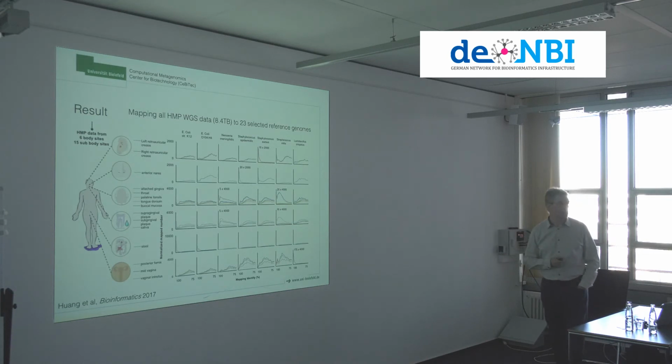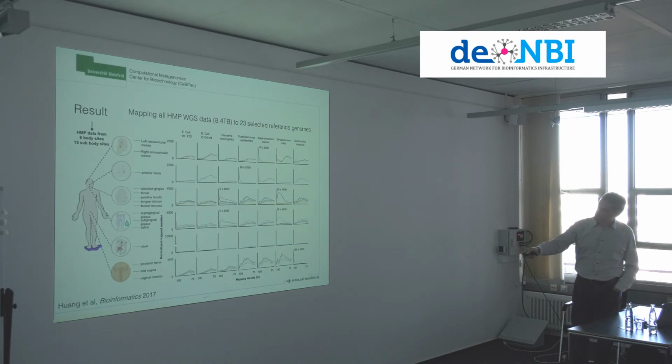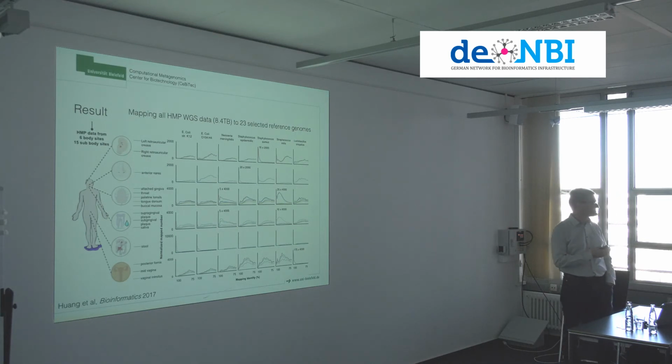And so, for instance, if you look at this one, this is E. coli. Where should it occur, or where would you expect it to occur? Of course, in the gut. This is a gut sample here. And what you see is that there are a lot of sequences. This is the y-axis, the number of hits basically you get, and the identity of the hit. So it's 100% identity. Many sequences have 100% identity to the E. coli, just as you would imagine, right?